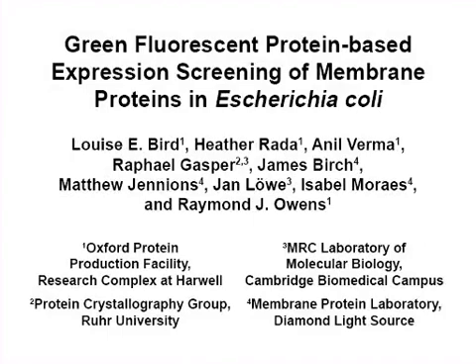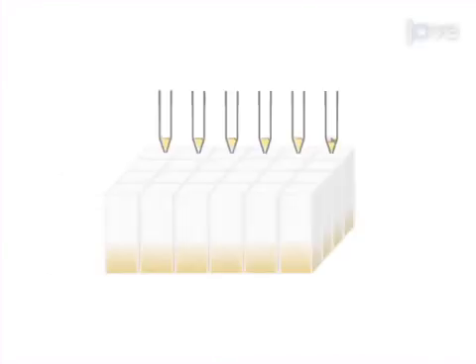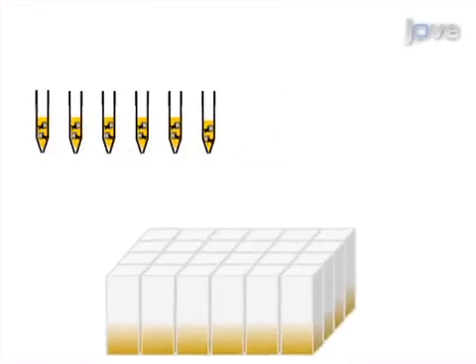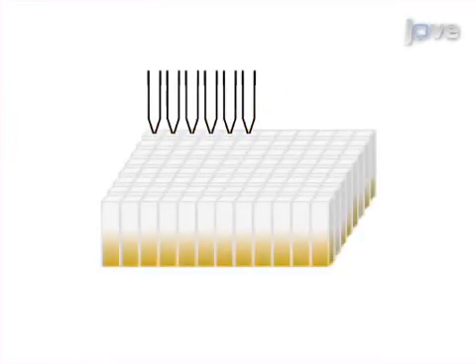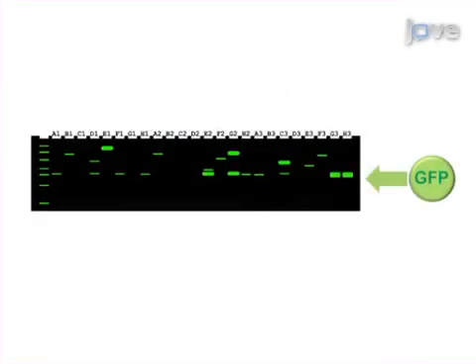The overall goal of this procedure is to identify membrane proteins expressed in Escherichia coli for structural and functional analyses. First, the bacteria are harvested, lysed and analysed by SDS-PAGE for visualisation of the correctly folded GFP proteins by in-gel fluorescence.